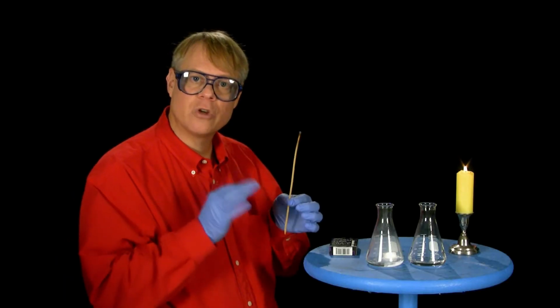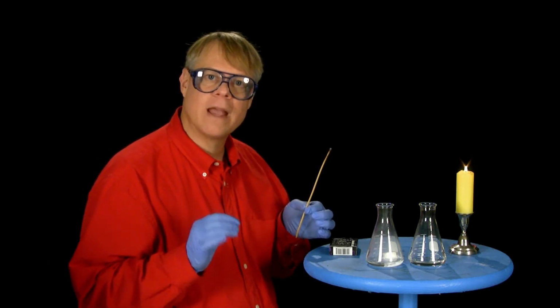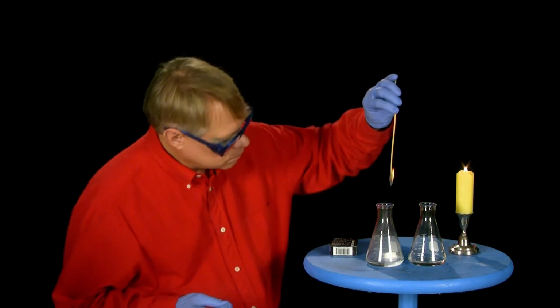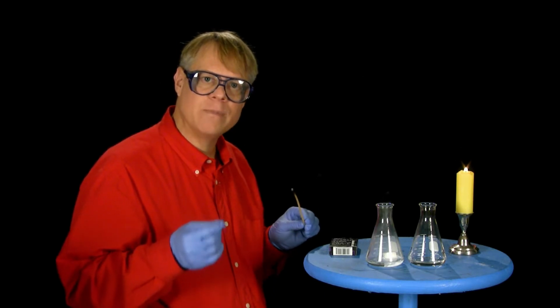And if I now search the jar by a taper, I shall have exactly the same effect produced upon the taper as I had from the gas which issued from the end of the chimney over the burning candle. It is exactly the same action and caused by the very same substance that issued from the candle. And in this way, we can get carbon dioxide in great abundance. We have already nearly filled the jar.